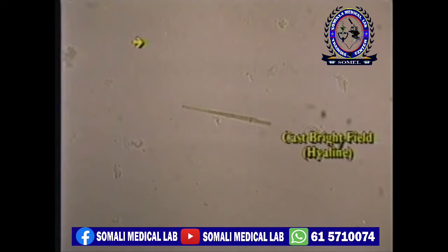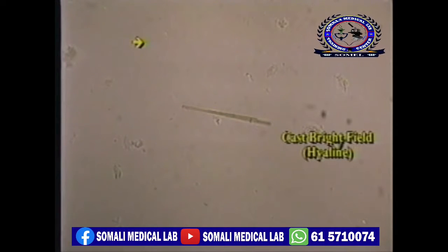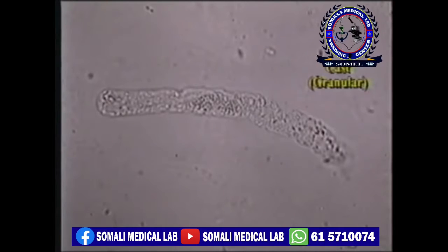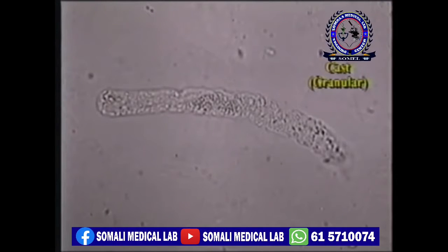Never mind. Hyaline casts are notoriously difficult to see on bright field. This again emphasizes the need for phase microscopy. In this slide, there is a granular cast under bright field microscopy. The degree of granularity is not important and subjective at best.